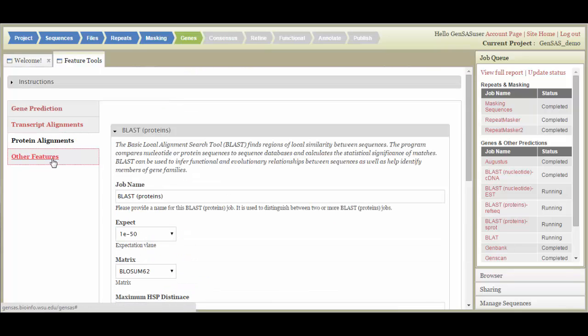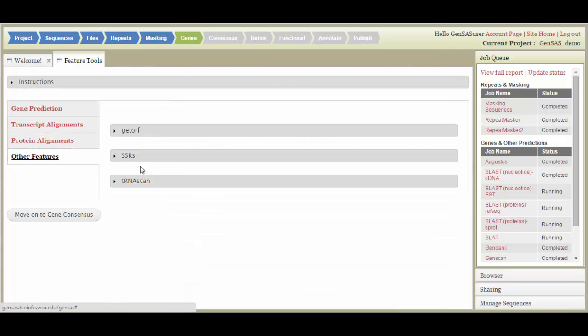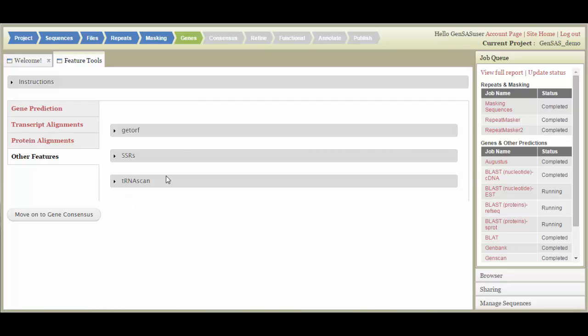In the Other Tools section, there is an ORF Finder, a SSR finding tool, and a tRNA scan. You can monitor the progress of the jobs in the queue. And, you do not have to remain logged into GenSaaS for these jobs to complete. Once all the jobs are complete, click on the Move to Gene Consensus button, and the Consensus step will become available.